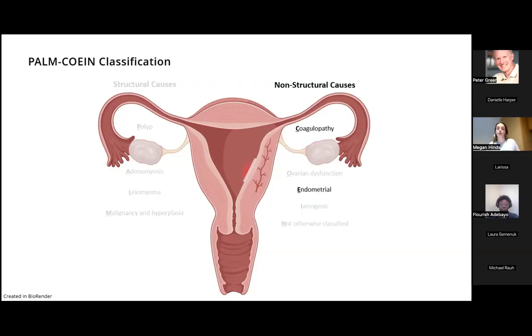There's huge variability, just in cellular content in general. Obviously, when I'm counting them with a hemocytometer right off the bat, I can't really differentiate between anything other than red blood cells, but we're looking at hundreds of millions of cells. It is just nuts. Some samples are thick with cells, and then some I get, there's nothing. I can't get anything from them.